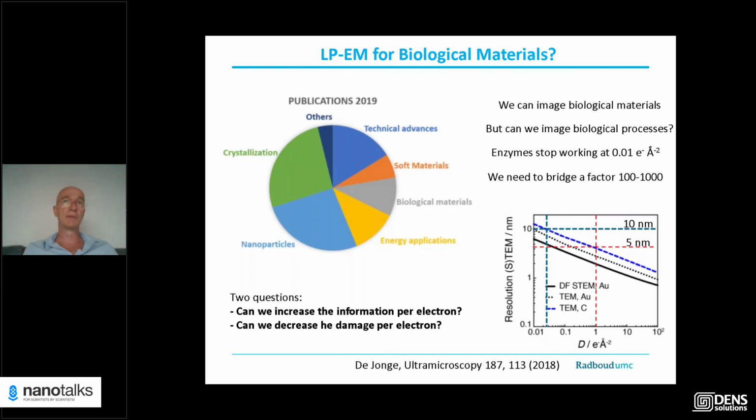Exactly. So you have to balance the concentrations and the reaction speeds to make sure that what you want to see is actually occurring in the center of your chip, so that you can have it in the viewing window. Excellent. Thank you.